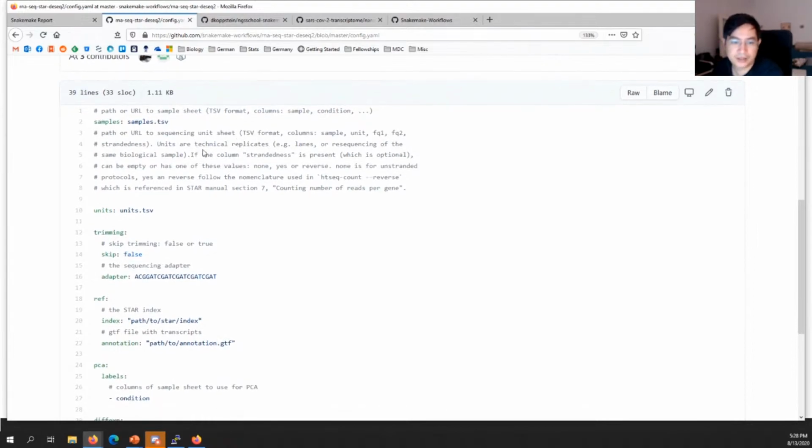In this case, this just tells us where the FASTQ files are located. So they might be located outside of this GitHub repository. It also tells you the strandedness, so which type of RNA-seq library is created. But it allows you to add arbitrary columns. So I often will specify the index as well, and many other variables per sample.